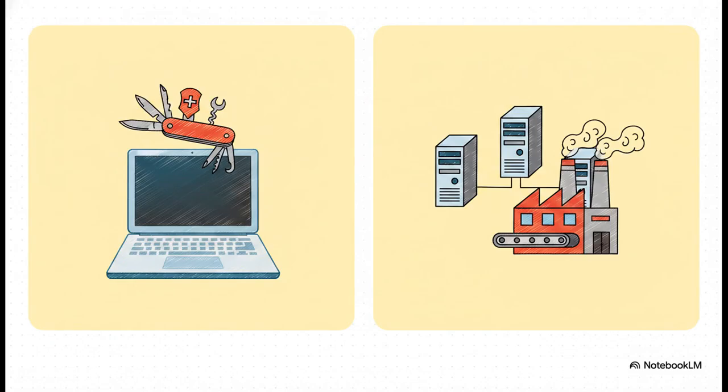So what we are really looking at here is a fundamental difference in architectural philosophy. The authors of the Uniflow paper note that while cfDNApipe is heavily praised for its highly integrated single-command execution, its single-computer design can make it a lot harder to scale across massive datasets on compute clusters. Conversely, Uniflow requires the user to adopt a full workflow management system. Yes, that's a slightly steeper learning curve, but in exchange, it offers massive scalability and deep extensibility for cluster environments. We aren't declaring a winner here, guys. Rather, we are seeing two excellent tools optimized for completely different use cases.